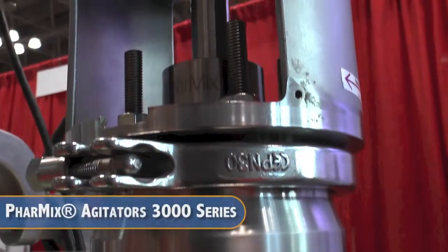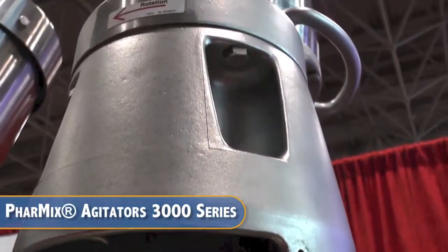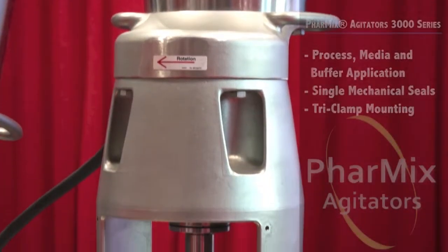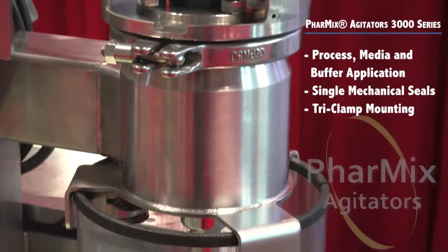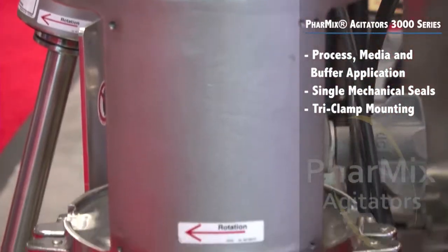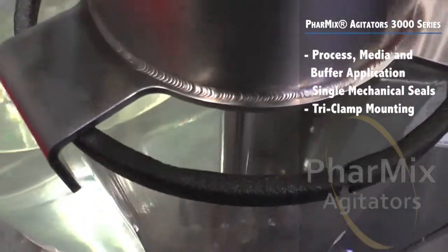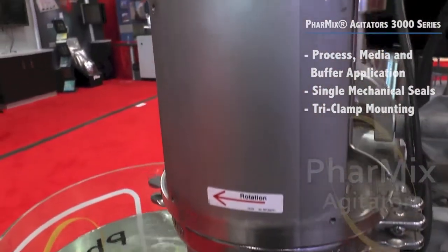The 3000 series agitators are perfect for process mixing, media and buffer preparation, and other continuous agitation needs in vessels up to 750 liters. It is supplied with single mechanical seals with or without a sanitary gland. The 3000 series agitator is conveniently supplied with space-saving tri-clamp mounting and is also furnished with a powerful SMI inverter duty drive, Sanifan motor with parallel helical gearing for quiet and smooth operation and reduced wear.